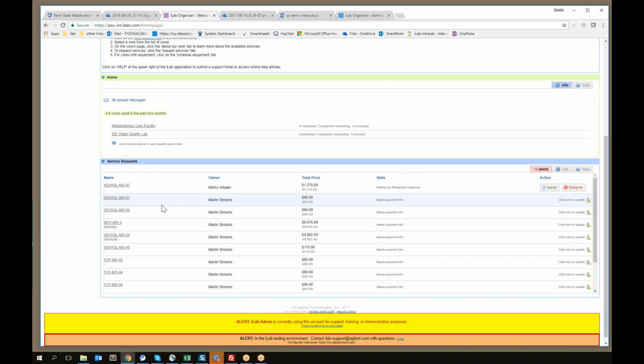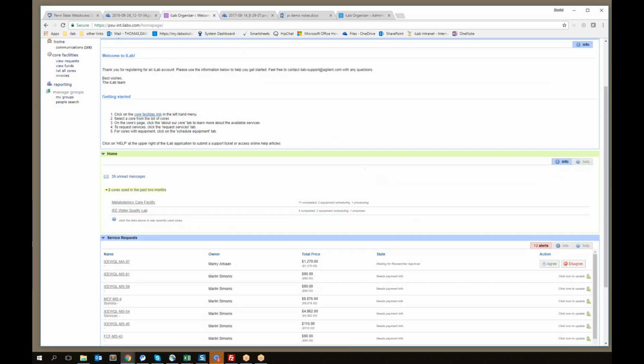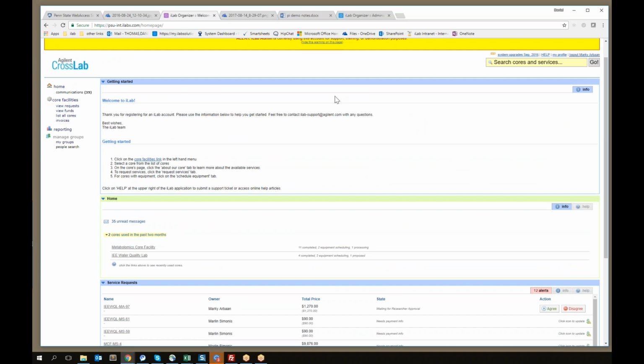But you don't have a deep level or degree of information here. It's sort of an area to just use if you need to take quick action. The very last area on your home screen that I'm going to talk about, and you'll actually have this navigation area, and it will appear throughout the system. No matter where you are, you'll have this navigation screen on the left-hand side.